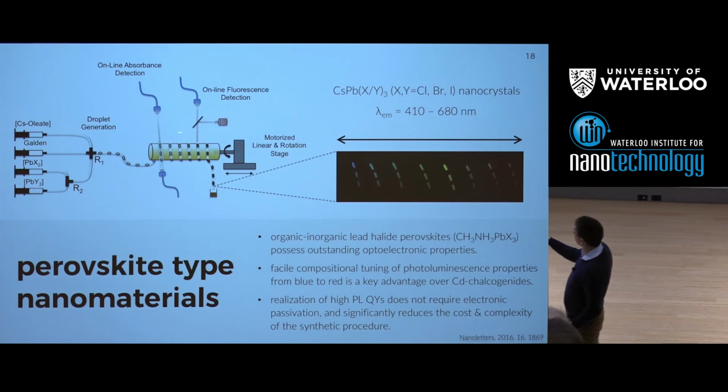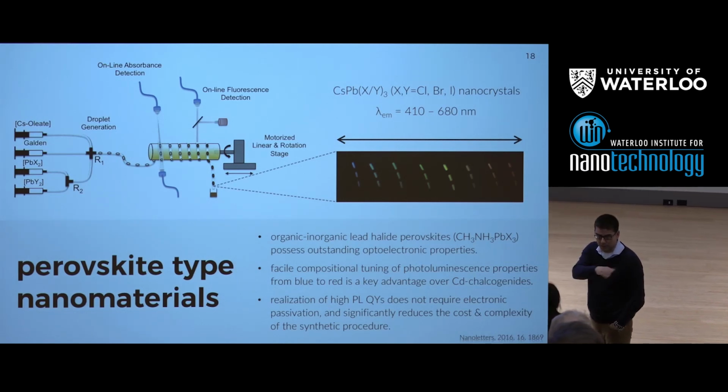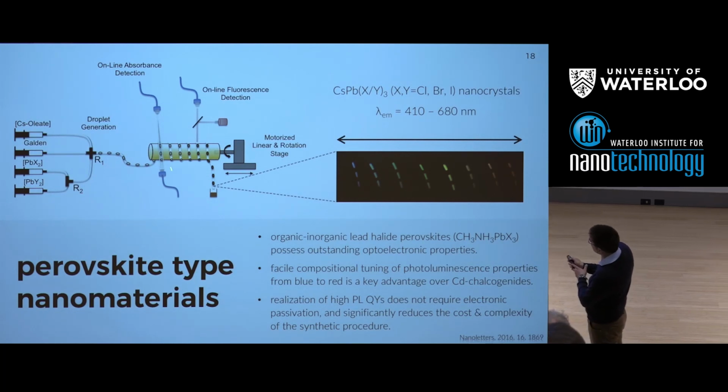I should also say that the volumes of these droplets are much bigger than the ones I was talking about in terms of doing the cell measurements. But the ability here to both control the temperature and do that extra absorption measurement is really important for us. Using this, the control we have is to about 0.1 degrees C.